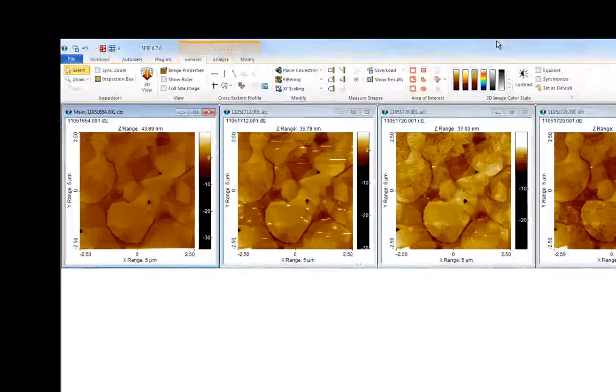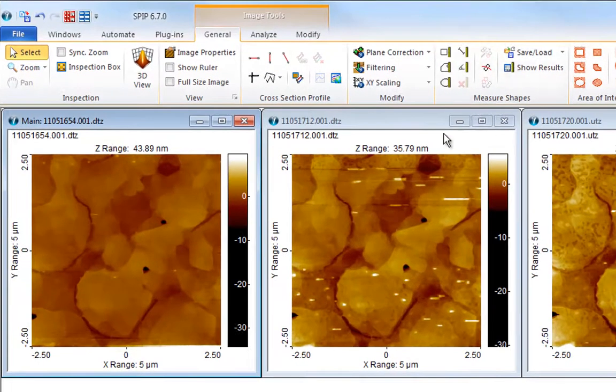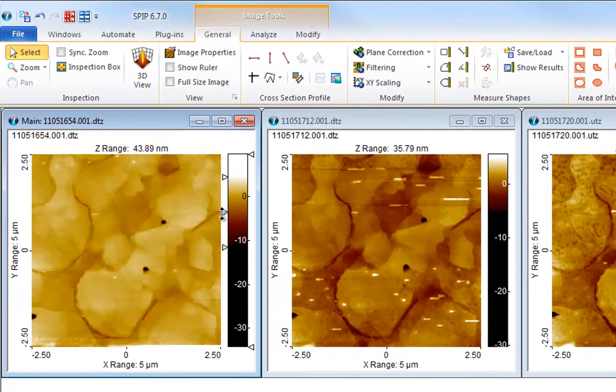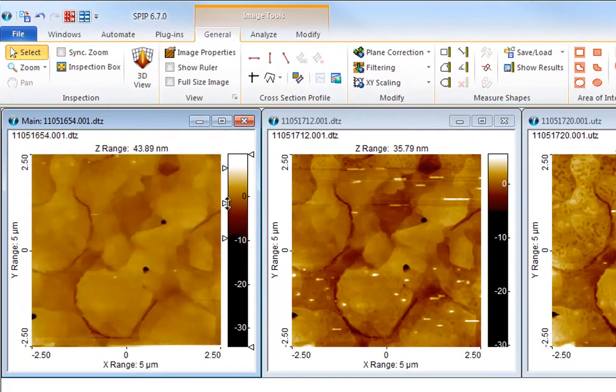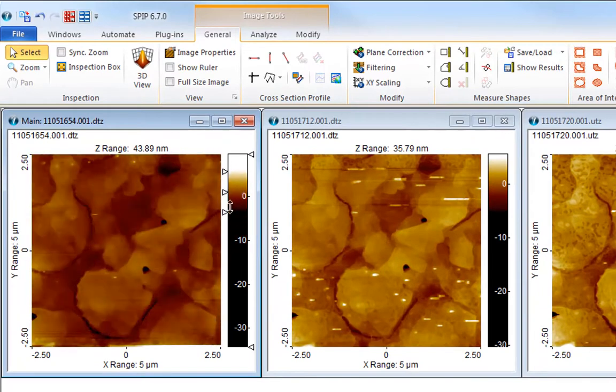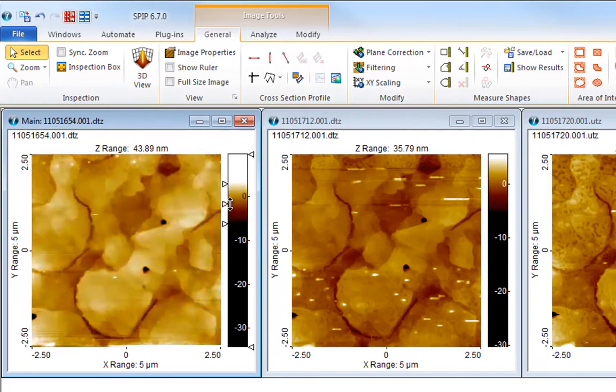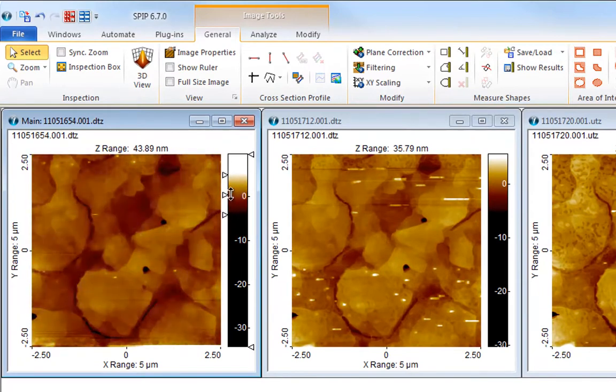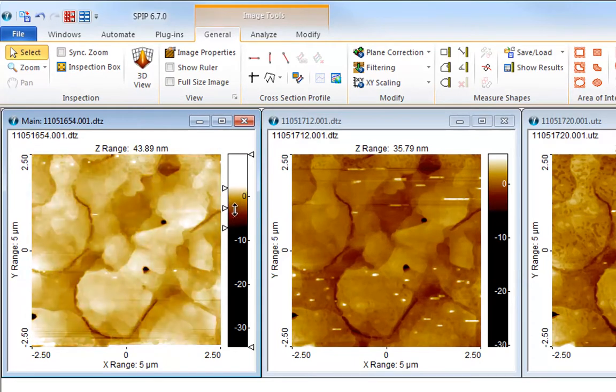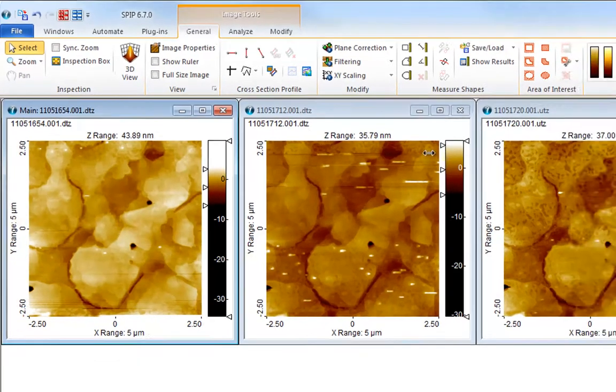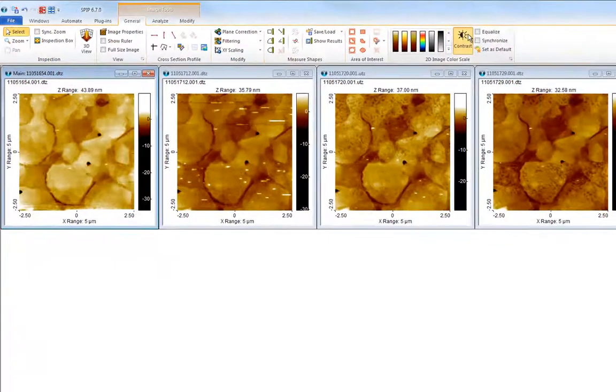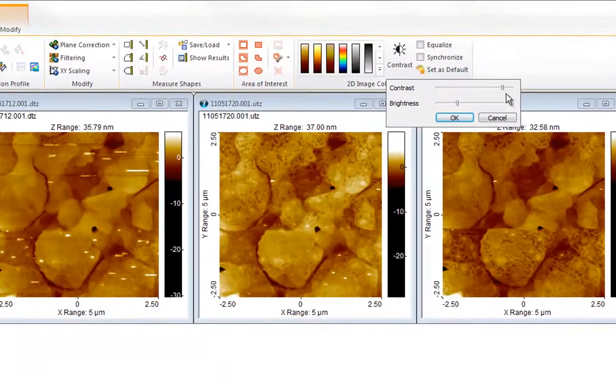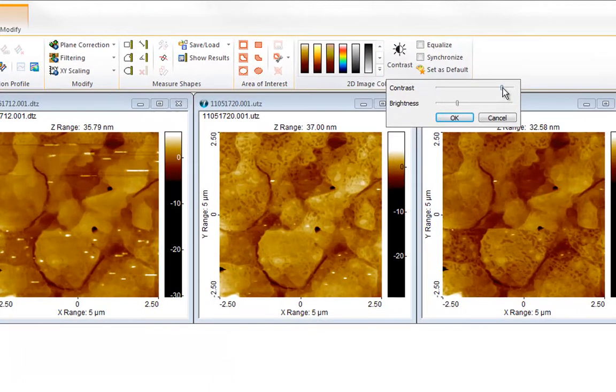The contrast and brightness is adjusted by dragging the color contrast markers on the left side of the color scale inside the image window. As an alternative a contrast brightness button is available in the ribbon.